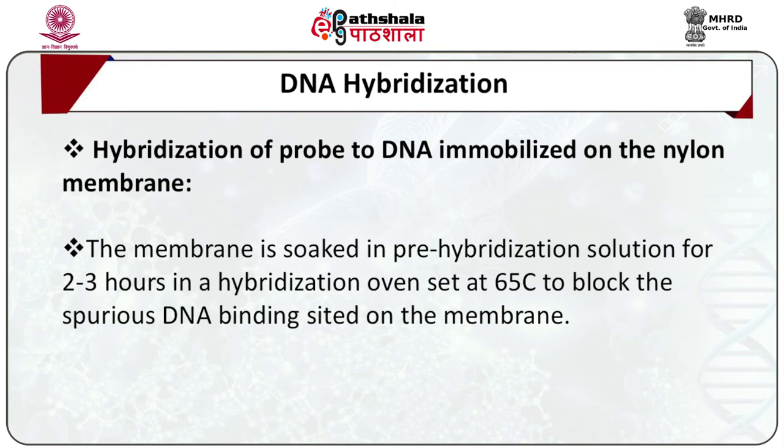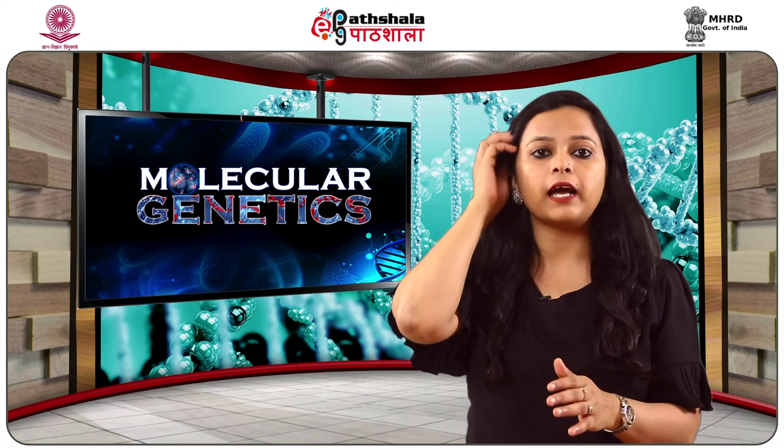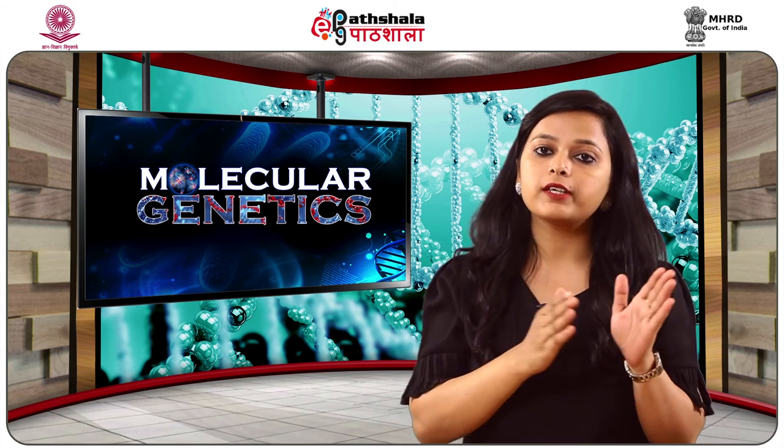Firstly, the membrane is soaked in pre-hybridization solution for 2 to 3 hours in a hybridization oven set at 65 degrees centigrade. It is a mixture of SSC, SDS, Denhardt's reagent and denatured salmon sperm DNA to block the spurious DNA binding sites on the membrane and hence ultimately decrease the chances of non-specific signals.